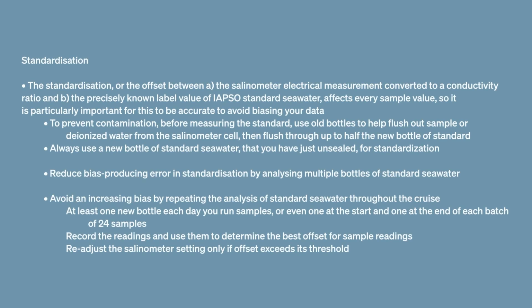And we can repeat this a third time from the same bottle. Standby, flush and fill, pause, read. If this is the first standardization after the instrument has been set up in this lab, it is advisable to repeat what we just did with 1 or 2 more bottles of newly opened standard seawater.